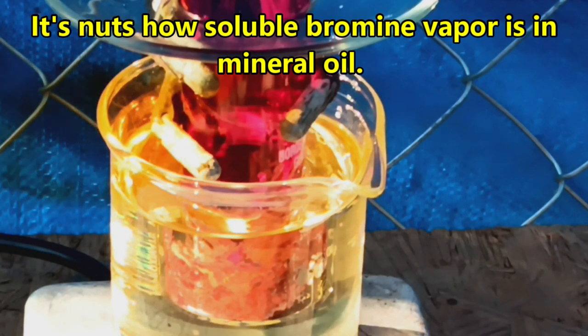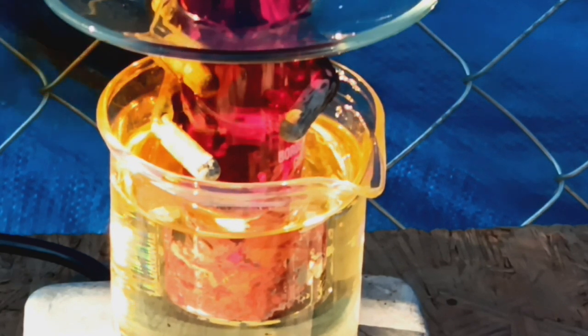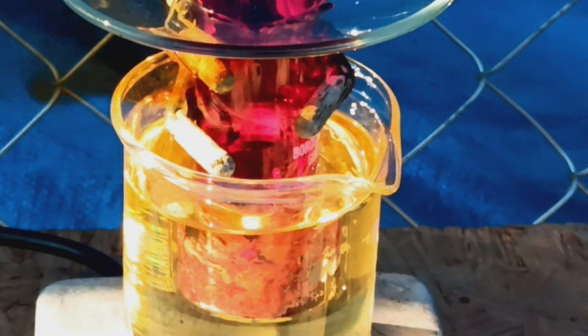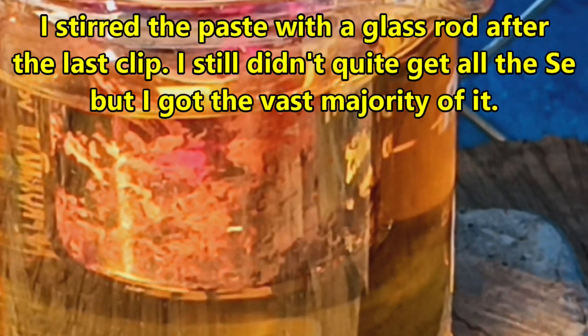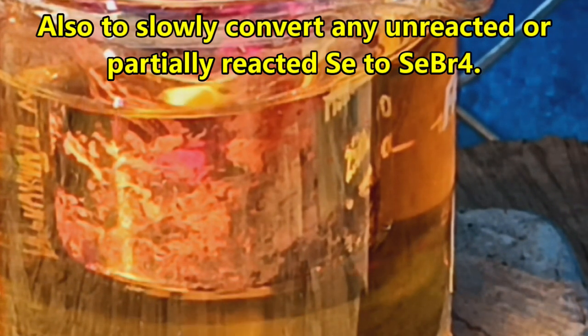Bromine is dissolving into the mineral oil - that looks like chemical weapons, bromine and mineral oil. God, I wonder what that would be like if you got that on you - that would suck so bad. At some point I'm just going to take it out of there, literally dump it out onto a piece of paper, then get it into a vial as fast as possible and probably put a drop of bromine in there just so it has a bromine atmosphere to preserve it. That's the best plan I can come up with.